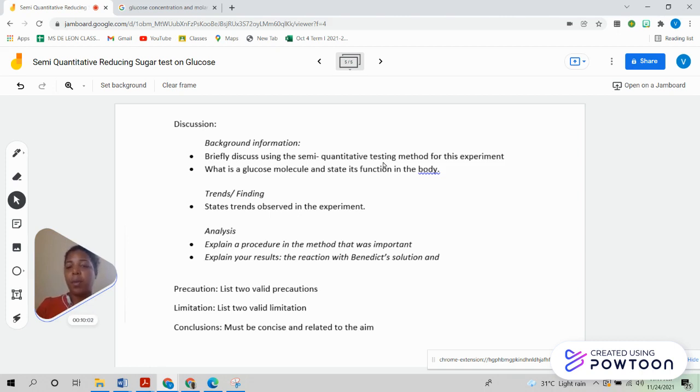Then I want you to give me your trends and findings. So what did you find as the molar quantity increased? What happened as you increased your glucose molarity? Did you have more precipitate? Did you have less precipitate? Did the color become more intense? Did the color not become intense? And then you will also have to tell me which concentration you found sample X to be. All that must be there in trends and findings.